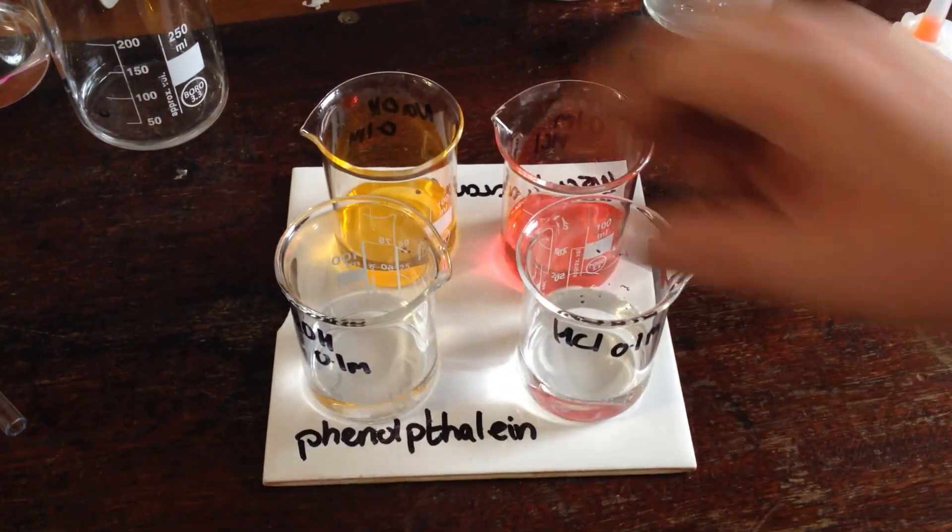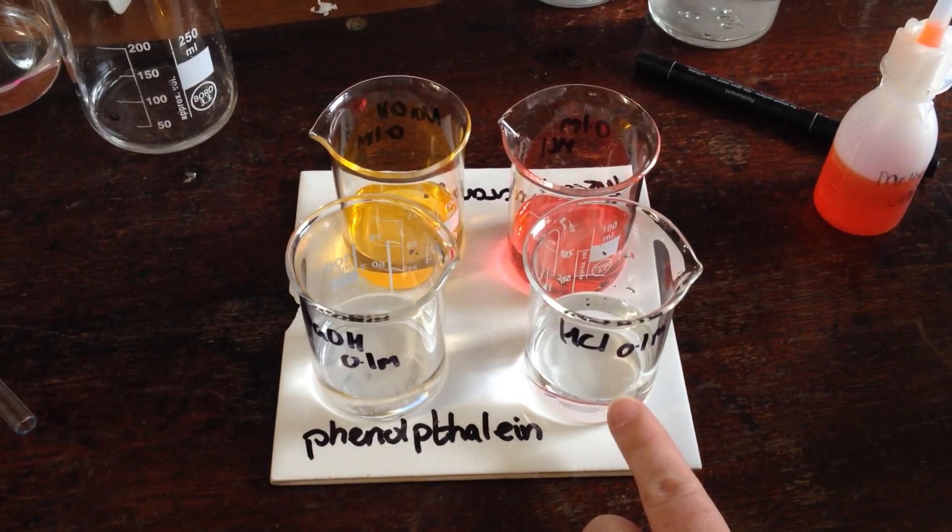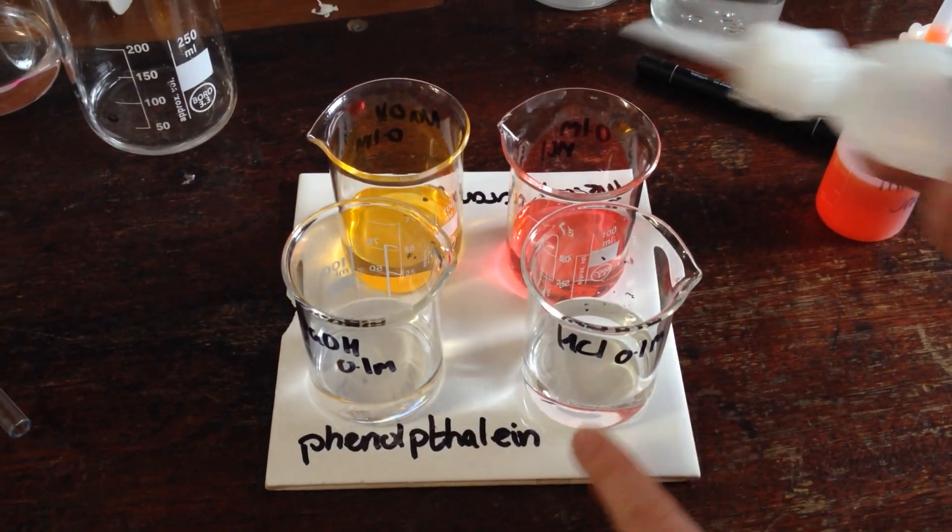Now let's have a look at phenolphthalein. Again we have 0.1 molar sodium hydroxide and 0.1 molar hydrochloric acid.